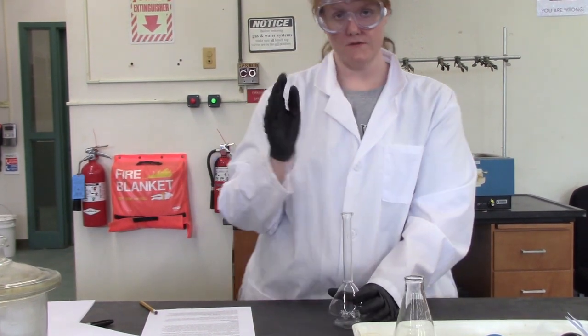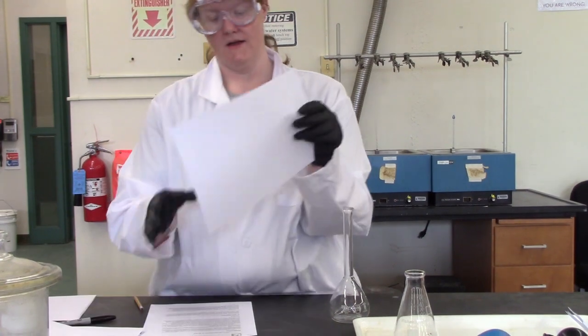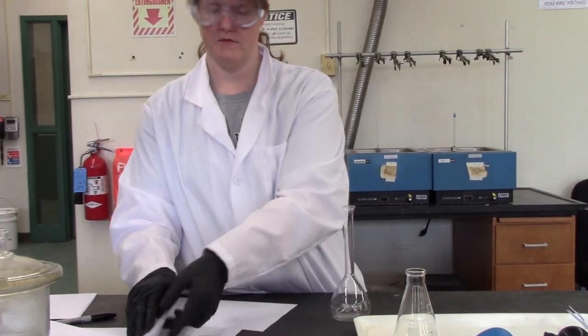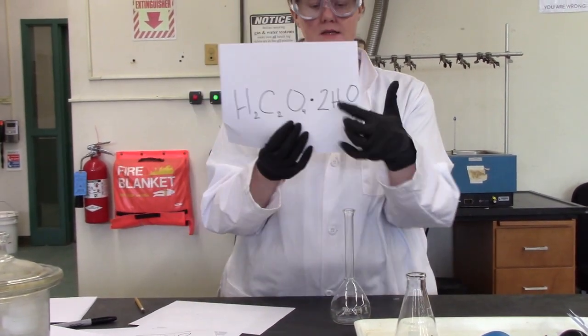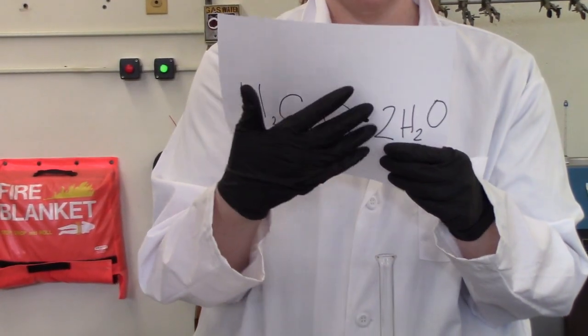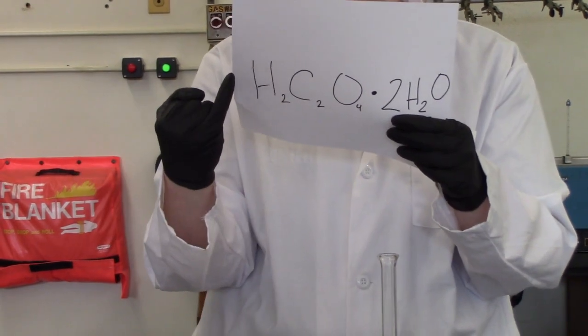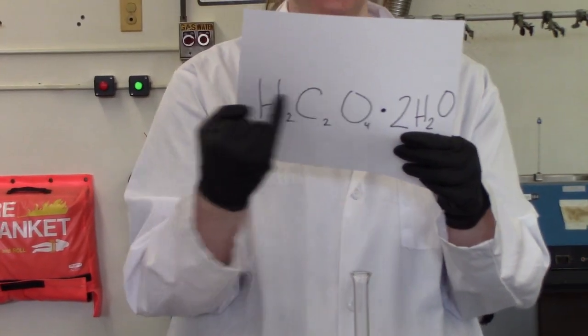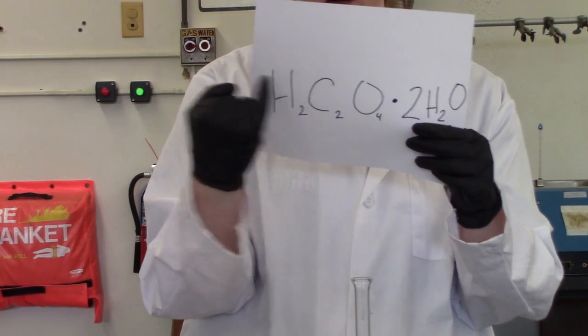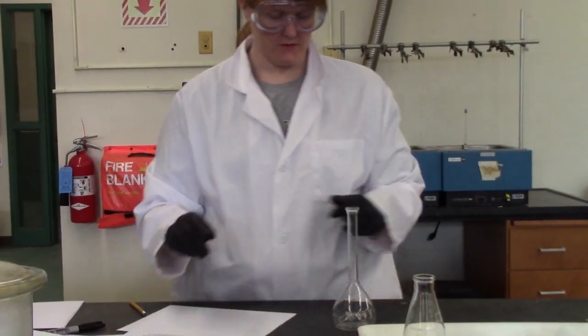Now at that point, once you've dissolved the acid, it is no longer oxalic acid dihydrate. It's not a dihydrate anymore. Once you have surrounded the oxalic acid with water, this drifts away into the solvent. It just becomes part of the solvent. So now the reacting species is just this part, the actual acid. Okay. And that's important when you're trying to write your reactions down.